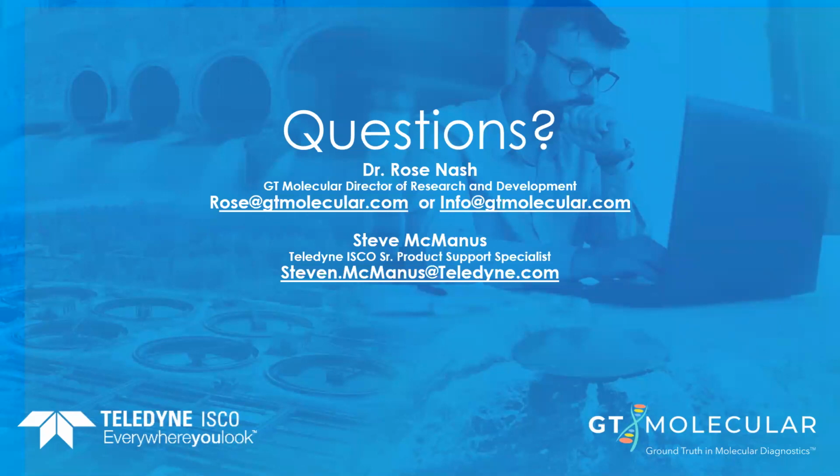It's always very interesting to bring on a new university with this type of testing, because we can very quickly point out which dorm they're quarantining their students in, because they always have a really high signal. And then it becomes a game of whack-a-mole, really, where that quarantine dorm signal stays high, and then as there are small outbreaks within the other dorms, that triggers university staff to go in and do testing to find the infected individuals and then to move them into the quarantine dorm. So you see the signals come up, and then the next week they've done their testing and moved, and it comes back down, and the quarantine dorm goes up.